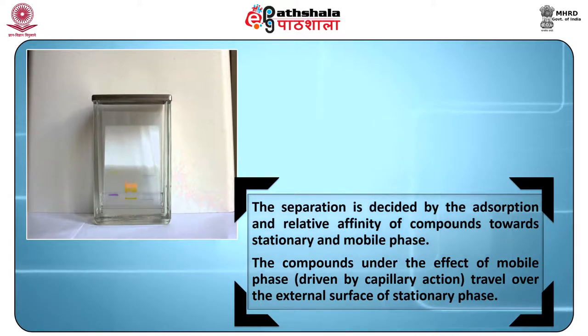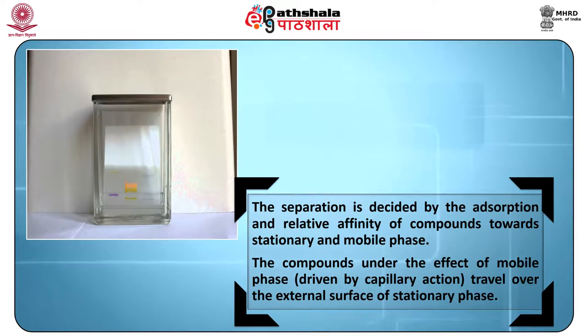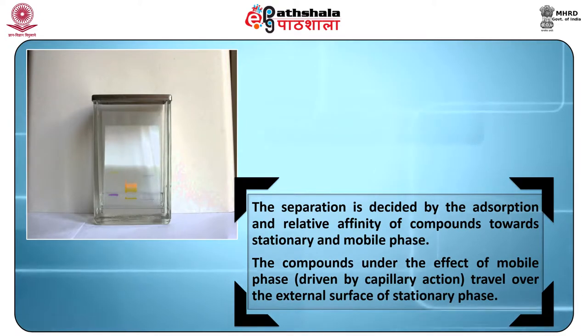Principle: similar to other chromatographic techniques, TLC also depends on the principle of separation. The separation is decided by the adsorption and relative affinity of the compounds towards the stationary and the mobile phase. The compounds, under the effect of the mobile phase, which is driven by capillary action, travel over the external surface of the stationary phase. During this movement, the compounds with the higher affinity to the stationary phase travel slowly while the others travel faster. Thus, the separation of the constituents in the mixture is achieved. Once the separation takes place, individual constituents are viewed as spots at respective levels of displacement on the plate. Their nature or character is recognized by means of suitable detection methods.